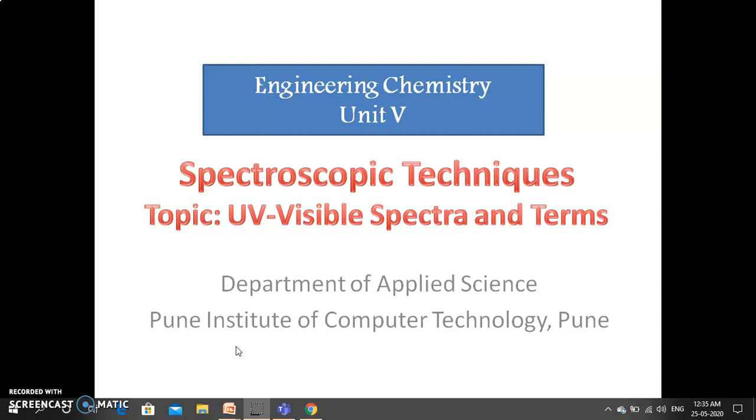Beer's law deals with the concentration of the medium, and it states that the absorption of UV visible light by a medium is directly proportional to the concentration of analyte in that medium. In the theory of electronic transition, whenever the analyte absorbs the UV visible radiation, this absorption leads to the excitation of electron from ground state energy level to the excited state energy level.